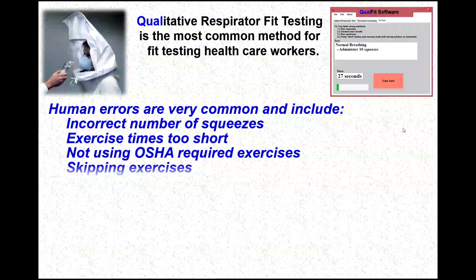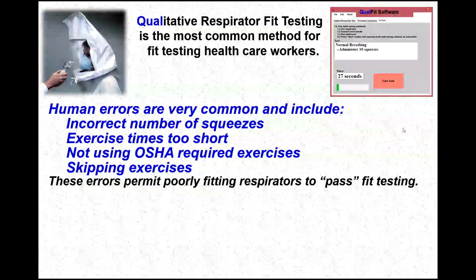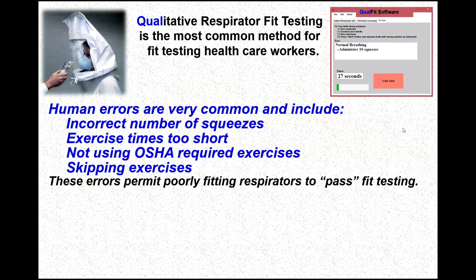But human errors are very common, and they include an incorrect number of squeezes, using exercise times that are too short, in other words, less than 1 minute each, not using all of the OSHA required exercises or modifying them, conducting the exercises incorrectly, or skipping the exercises. Any and all of these errors permit poorly fitting respirators to potentially pass the fit test.